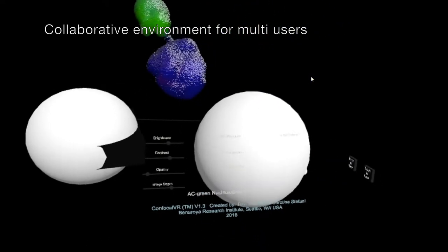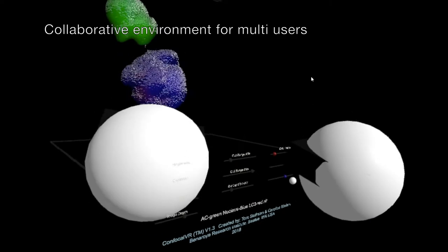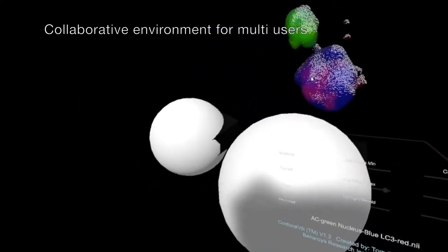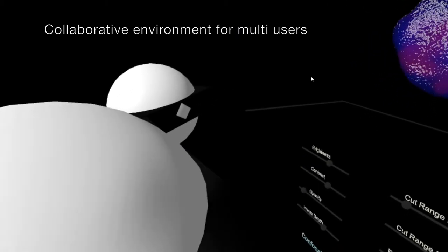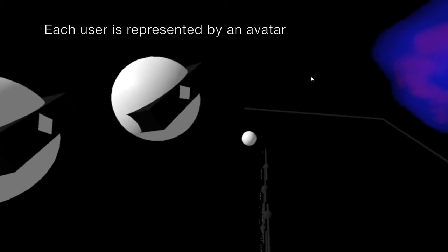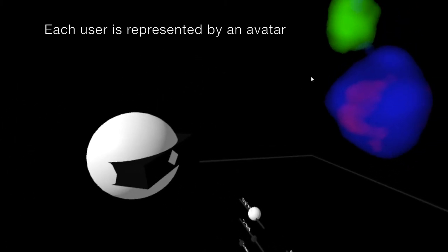That is a great image — it gives you a full depth of where everything is. And if I turn off the light from the outside, you can even see through it if you want.